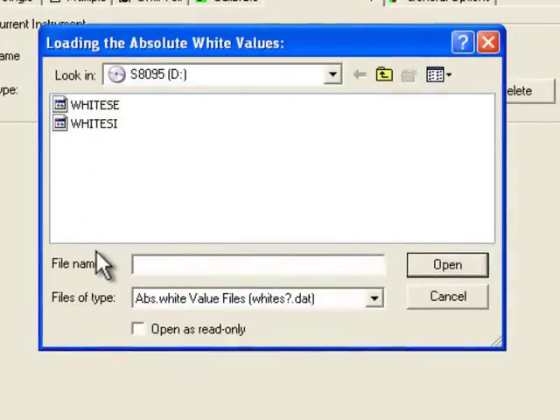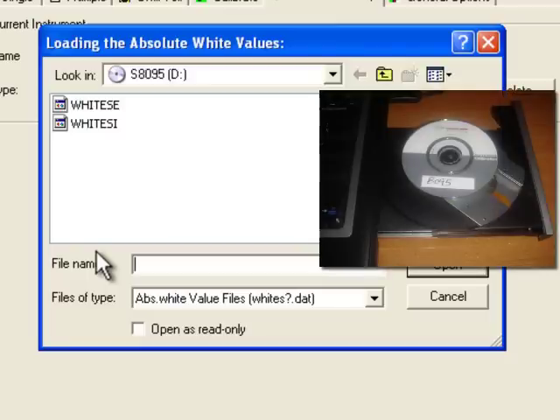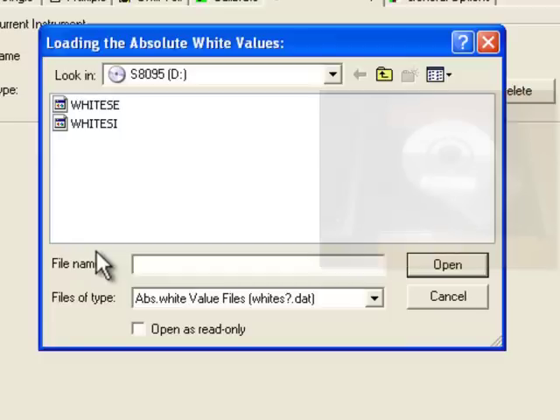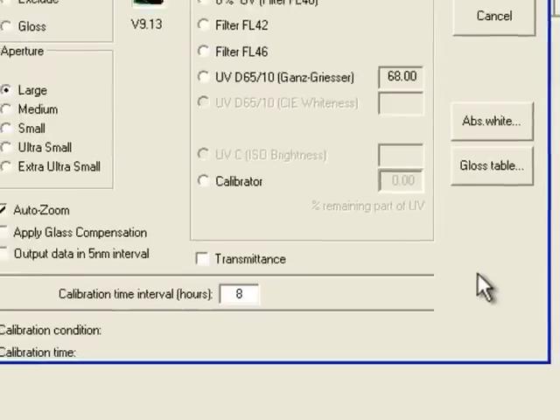At this point, the system dialog box will open and allow you to insert the calibration CD into the drive of your computer. Find the drive that the calibration disk is inserted into. It is important to select both files and press the Open button.